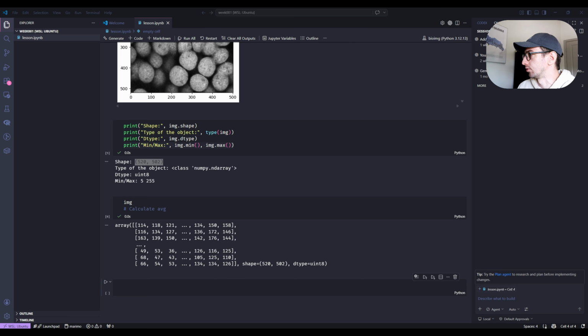Okay, I see that some people finished it. Nice. So in this case, can someone put it to the Telegram channel? And we will check it. But we want to generate an image, so we don't want just to calculate the mean. We want to generate a binary image where instead of the values from 0 to 255, we want to assign, for example, if the value inside of the, okay, I can put it.